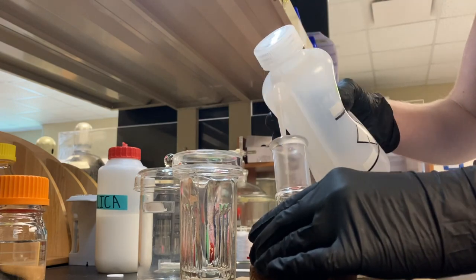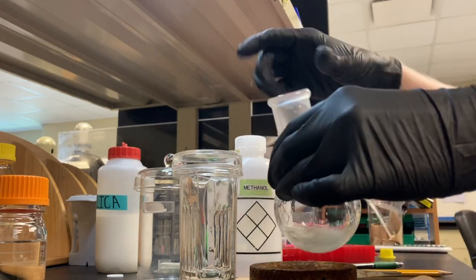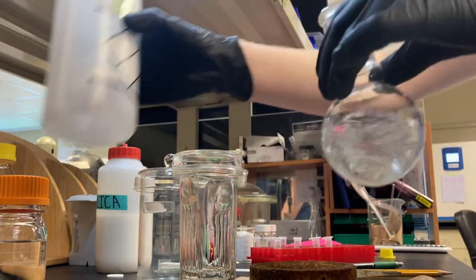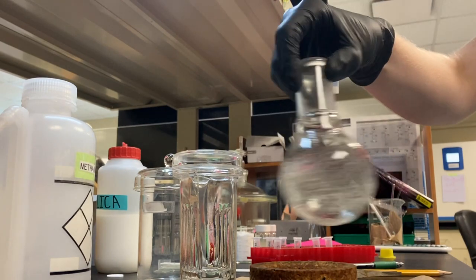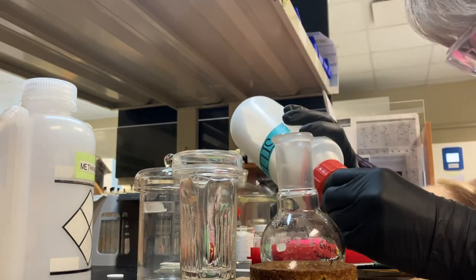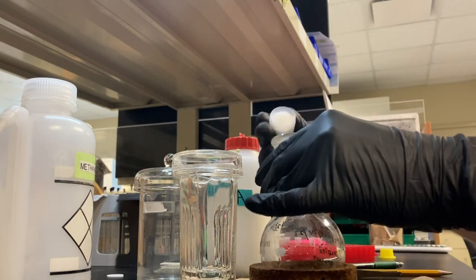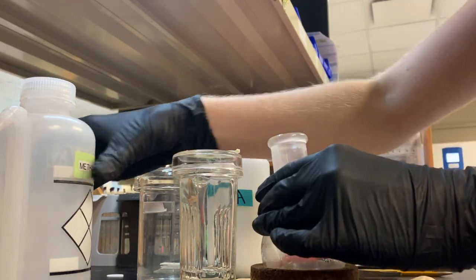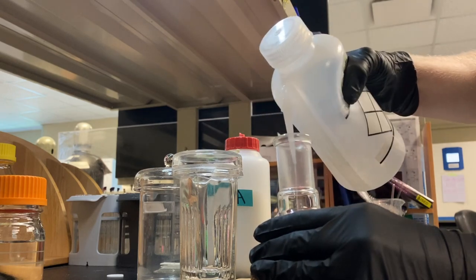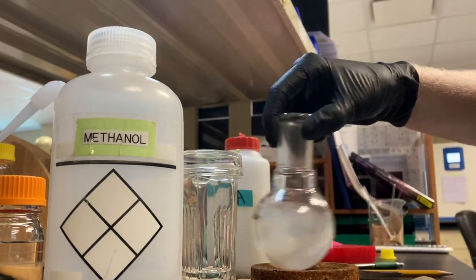After you ensure your spot's location, you dissolve your sample with any solvent it dissolves in — typically I use methanol, though a lot of people use dichloromethane because it works just as well. You swirl it up real good, then you can add in your silica powder, which mixes in with your compound so it can be put onto a column. We have a purification system called the Biotage that does that for us. This technique was originally designed to be done by hand, but technology has come a long way.